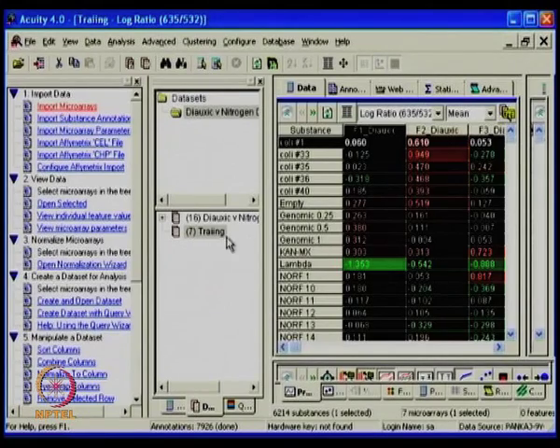Yeah. Now this is the one to get all the complete data. You can also have other ways, as you suggested, with p-value importance coming in or log fold change values coming in. You can define criteria for doing that. The way to do that, again, look at the common task pane. We have done the 3 steps, and now after doing normalization, I can click on create and open data set.